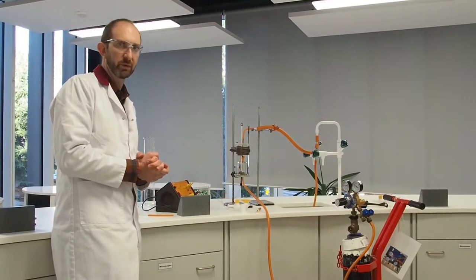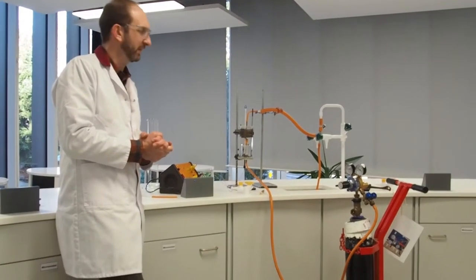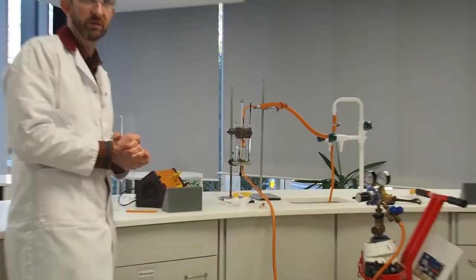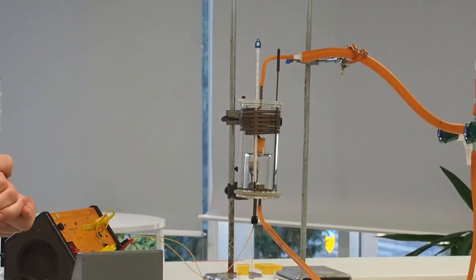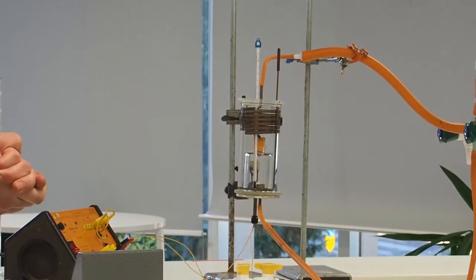What we have here is a piece of equipment called a bomb calorimeter which overcomes many of those flaws in that previous experiment. I'm going to use that to talk about why this is a much more robust and valid experiment if you want to calculate the true energy of the food type.